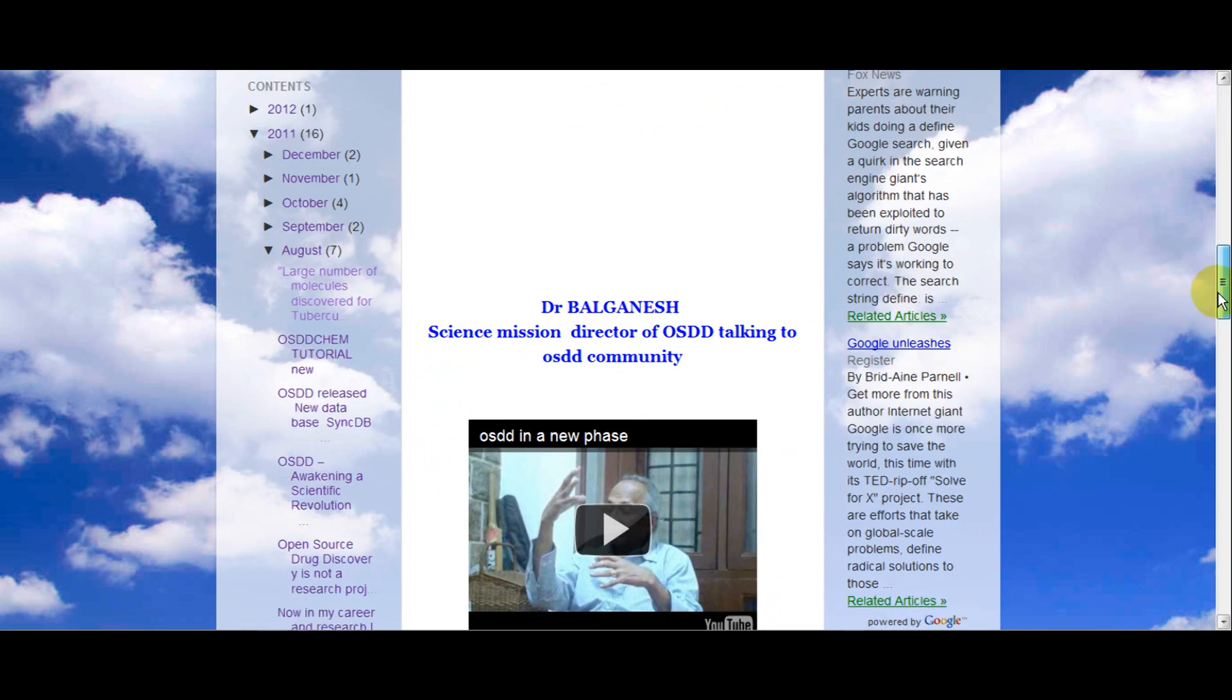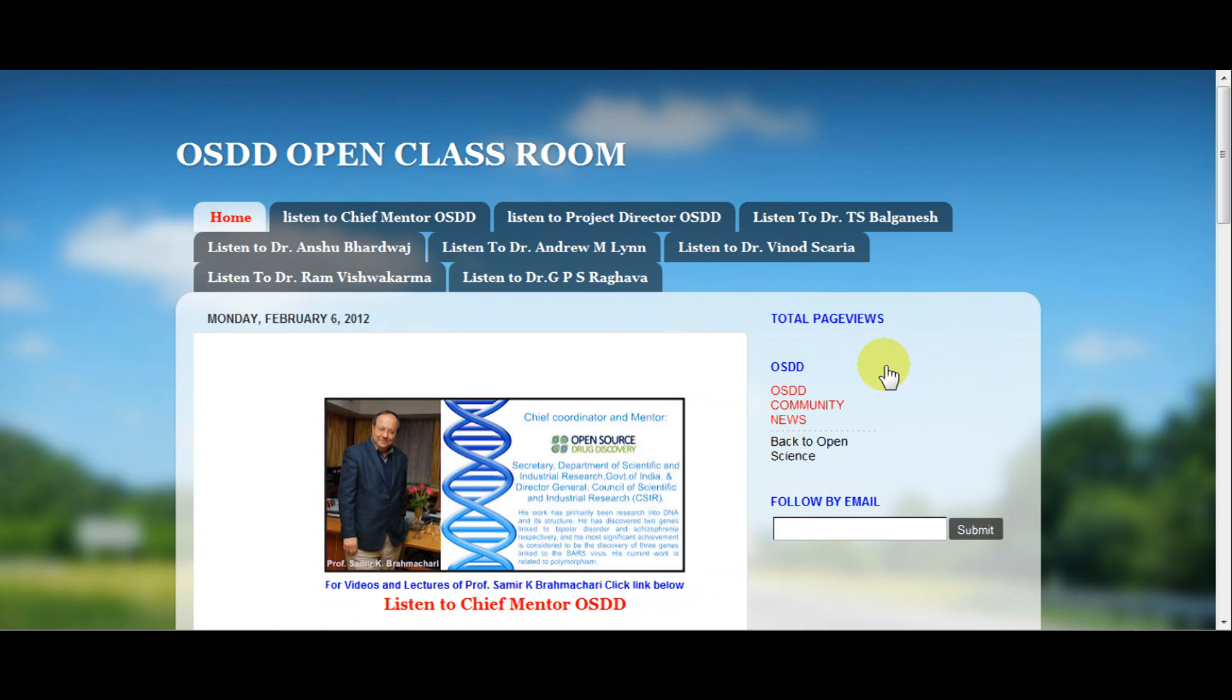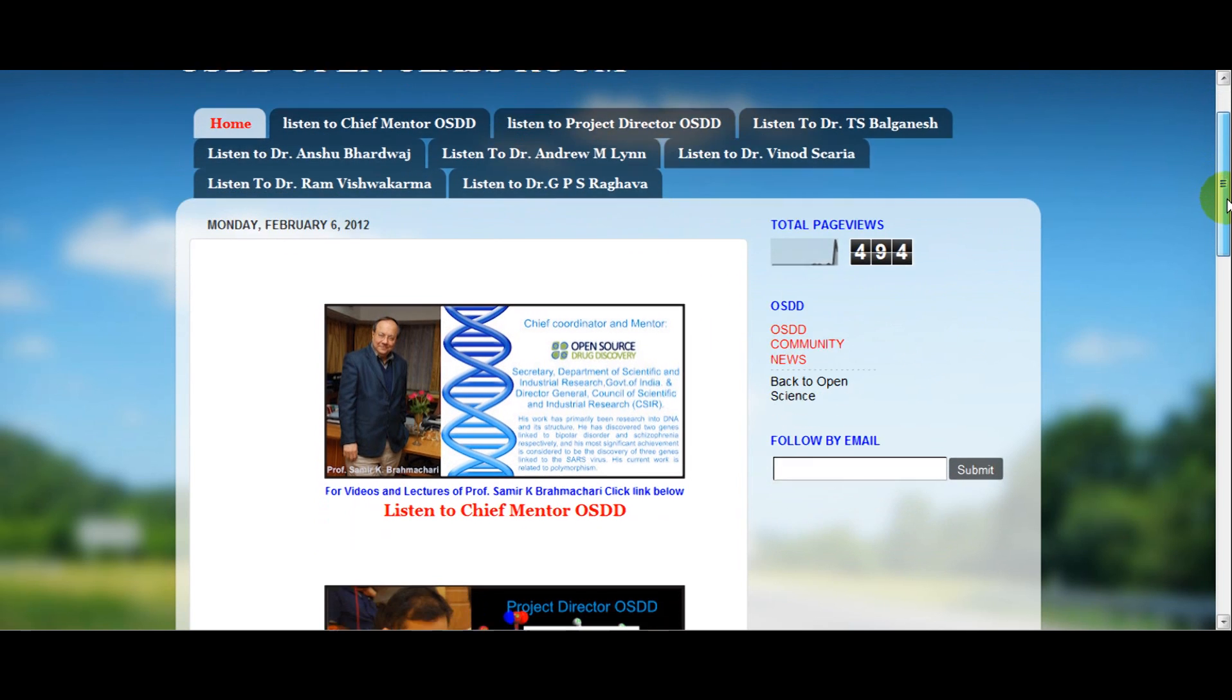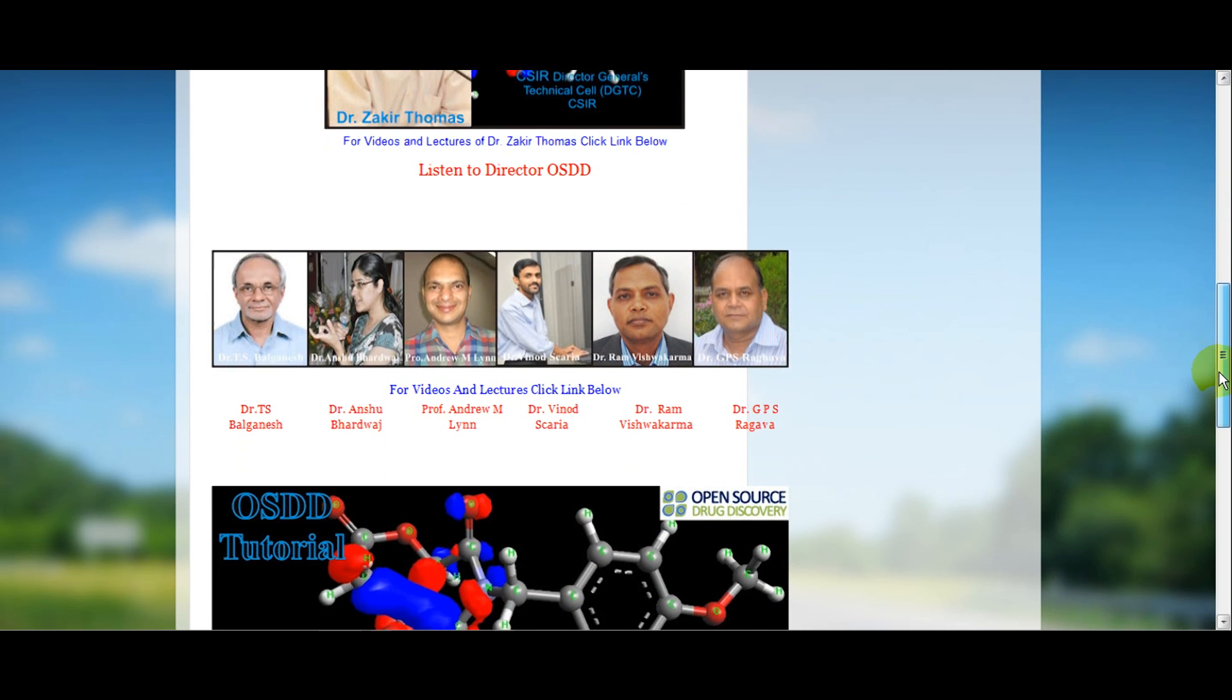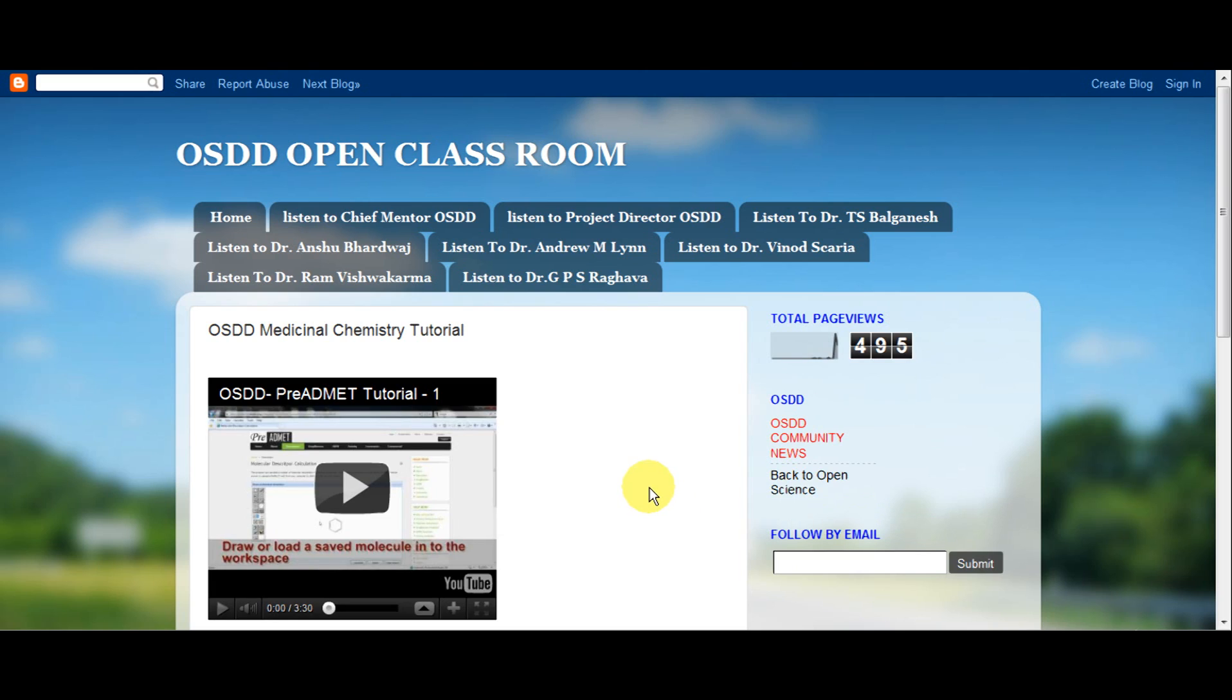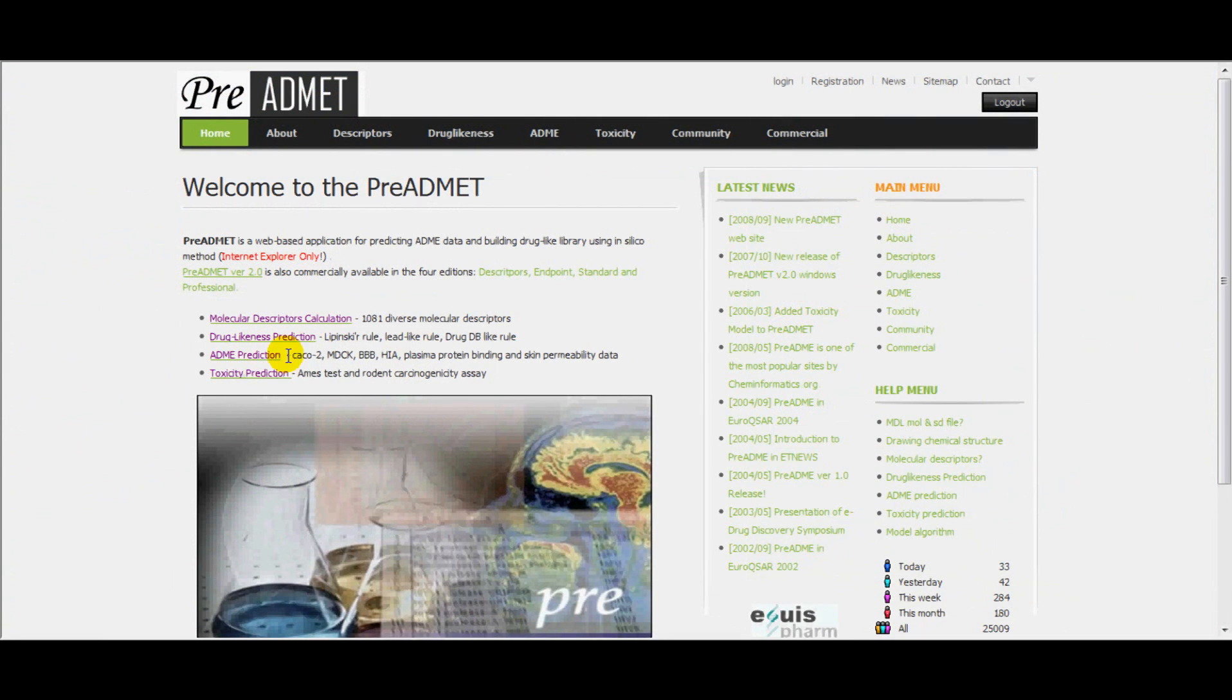Then go to OSDD open class and select medicinal chemistry. In the medicinal chemistry tutorial, we have learned about how to work on different program modules of ADMET, such as molecular descriptor calculation, drug likeness prediction, ADME prediction, and toxicity prediction. In this tutorial, you can learn about drug likeness prediction in detail.